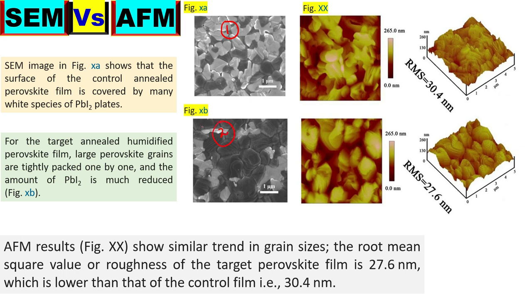These are basically SEM images. This is the sample number 1 AFM image. This is basically the two-dimensional image, and this is the three-dimensional image of sample 1. Here this is basically sample 2 and this is the two-dimensional image. This is the three-dimensional image.